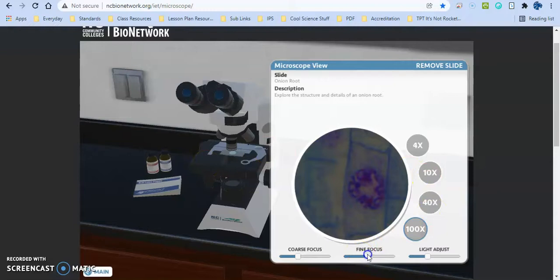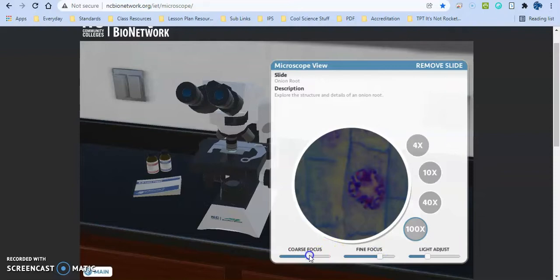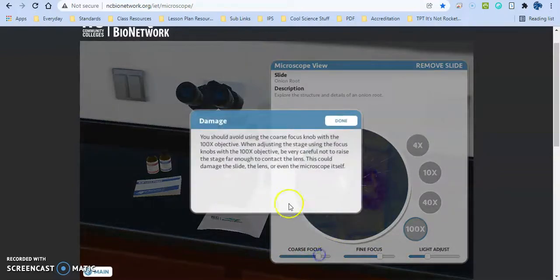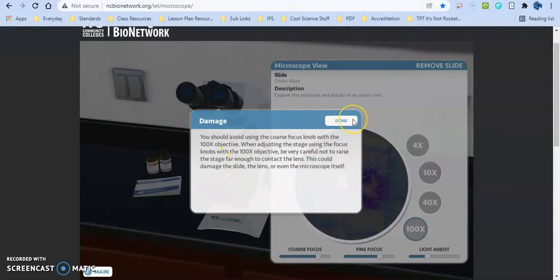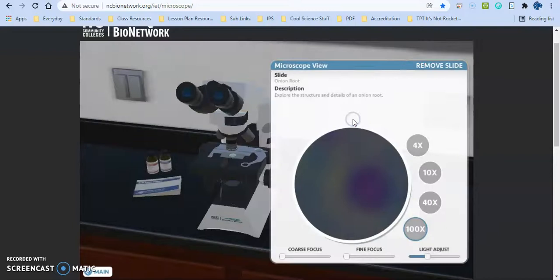Another thing that happens here is if they try to use anything but the fine focus when they are on this high power objective, it's going to go ahead and say you might have just damaged the microscope. So it's a good way to teach them this skill before they actually have a couple hundred dollar microscope in their hands and make that mistake. So it's really good for them to start off with before you actually get them to use them in class.